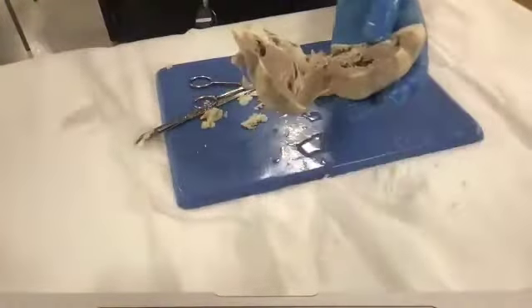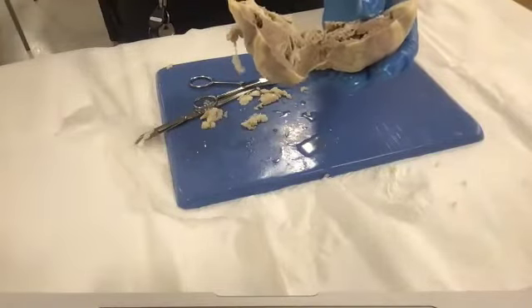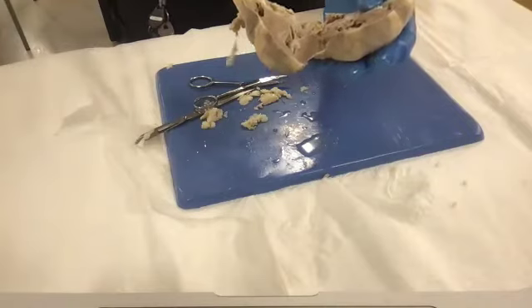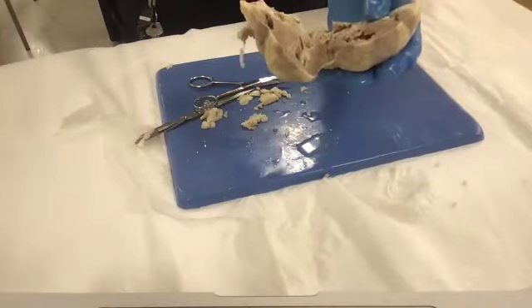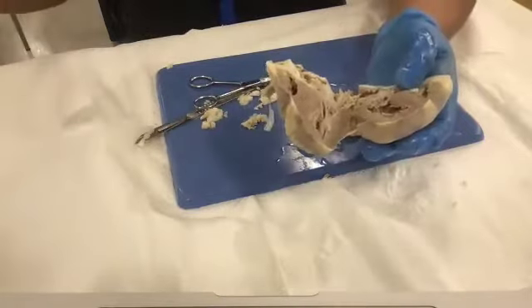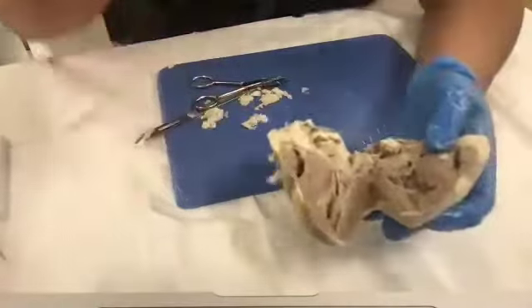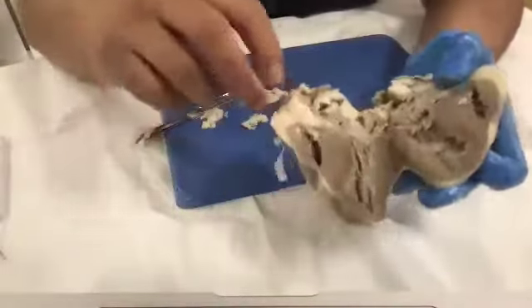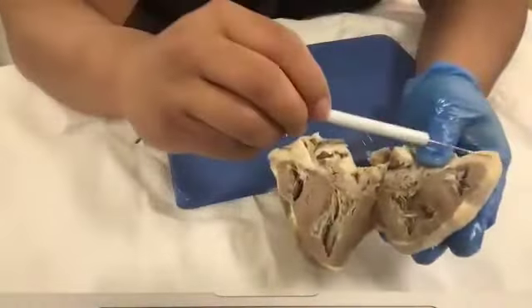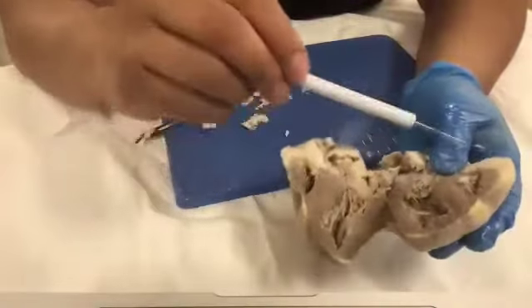So those of you who are on the pig, once you've looked at the skin, open up one of the arms or legs. Now look at the muscle, tendons, and all those other things. And then I'll go through that. Of course, I'll include everyone at home as well. So you know the layers. You have your epicardium, of course, the tough layer, pericardium, on top of that.